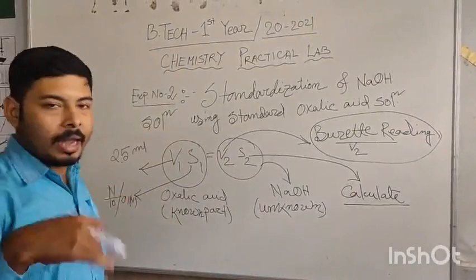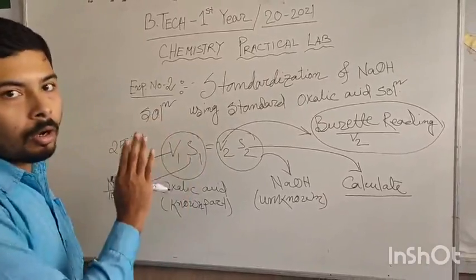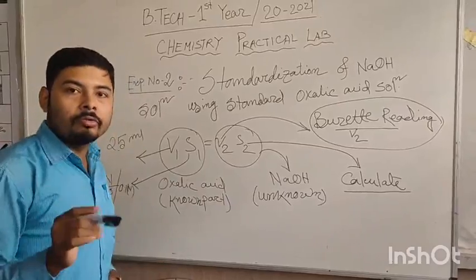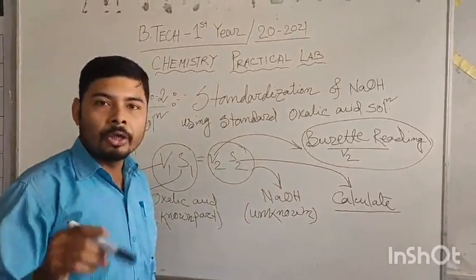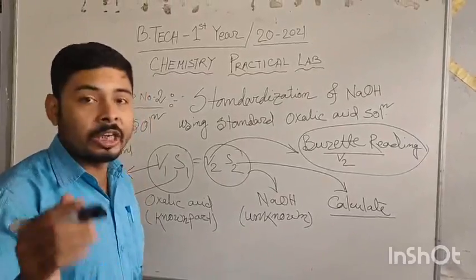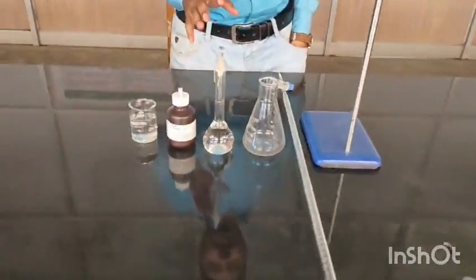Again I am saying that whenever you are studying these video lectures, please refer to your manual also for better understanding, because everything is written in the manual. Also I request you, before coming to the lab, go through your manual, so that you can understand everything whenever we physically do the experiment. Here is your basic setup for the standardization of NaOH.